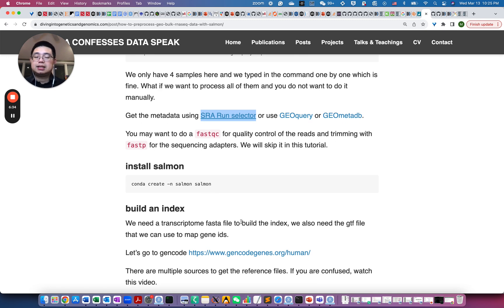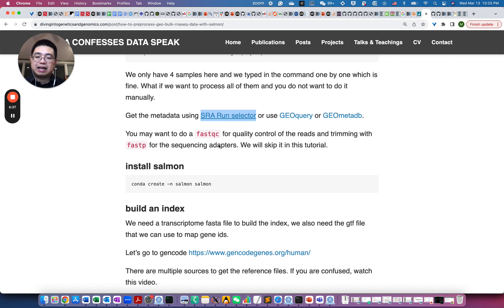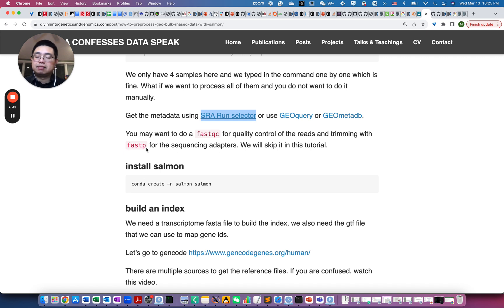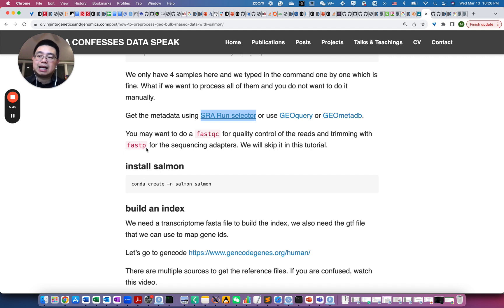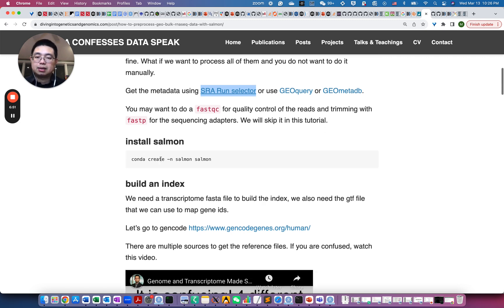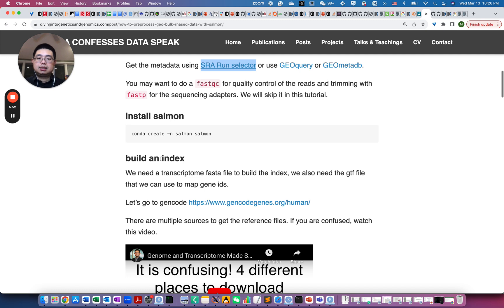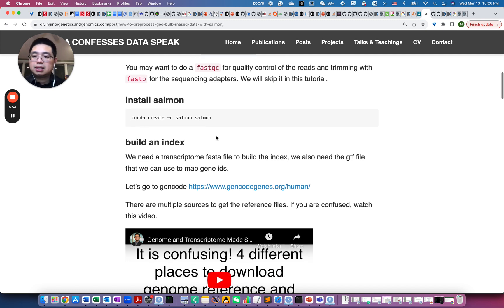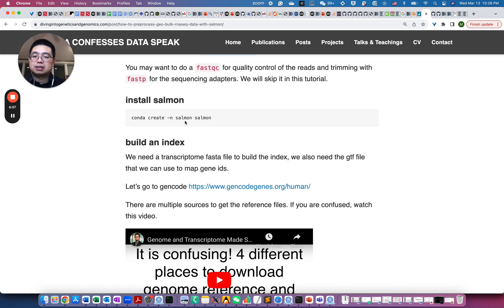So in this example, I also skipped FastQC to look for the quality of the reads. And if there are, for example, a lot of contaminations, the adapter sequencing adapters, you might also want to use a tool called FastP to remove those adapters. But I will skip it for this. So now next step is to install Salmon.